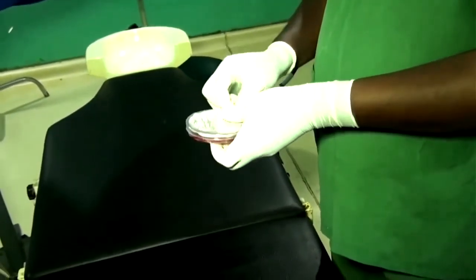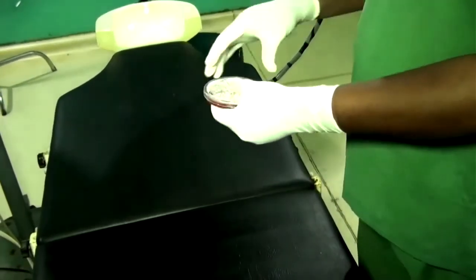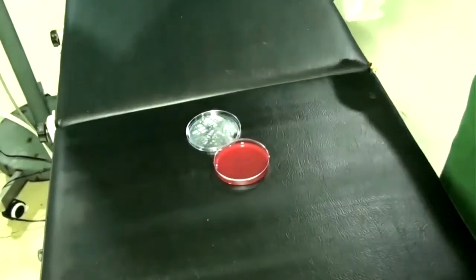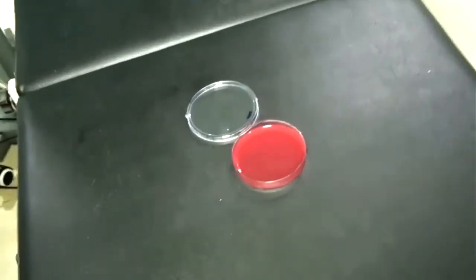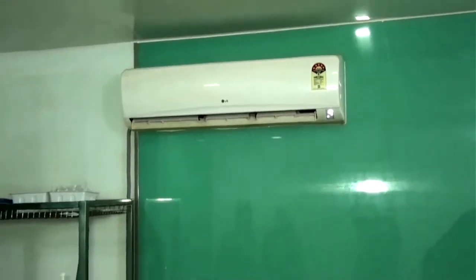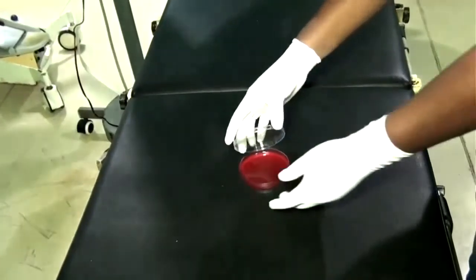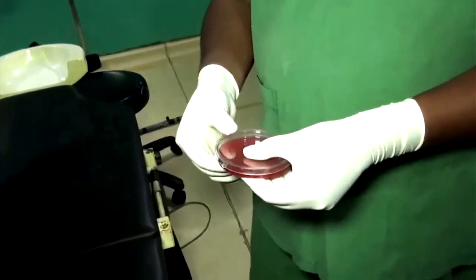Now what I'm demonstrating is the open plate technique. The common mistake we do is we keep the cap open upside down. So it should be ideally facing down so that it doesn't collect the bacteria. It's opened and left for half an hour with the AC on. Leave the theater closed, close it, seal it, label it and send it for culture.